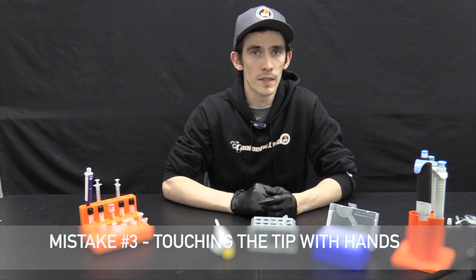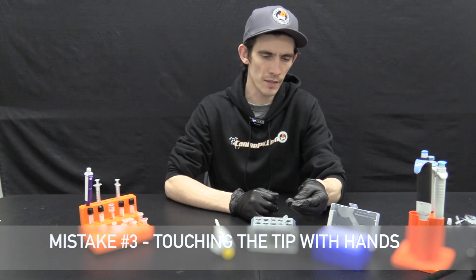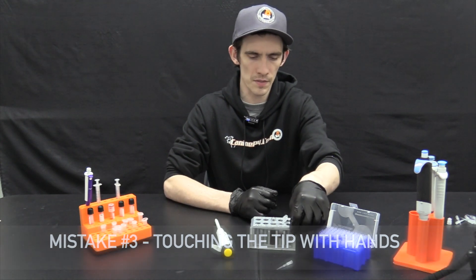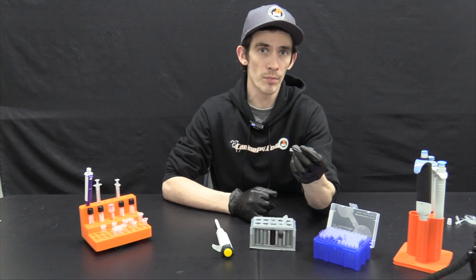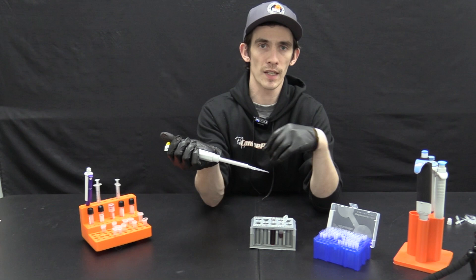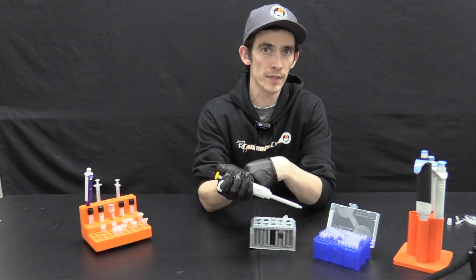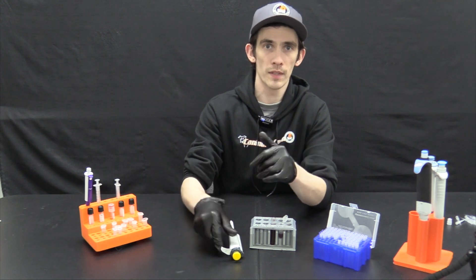The last common mistake is touching the tip with your bare hands or leaving it laying on a dirty surface. This can contaminate the plastic of the tip and also affect your results. We want to keep the tip as clean as possible. Use racked pipette tips and gloves at every given opportunity.